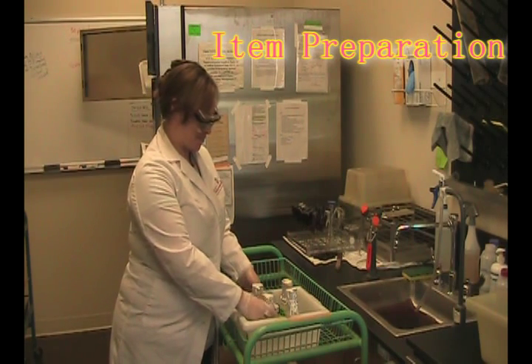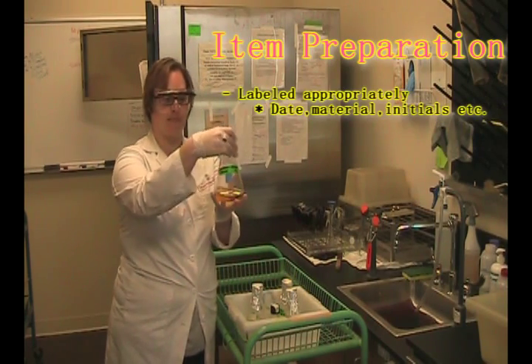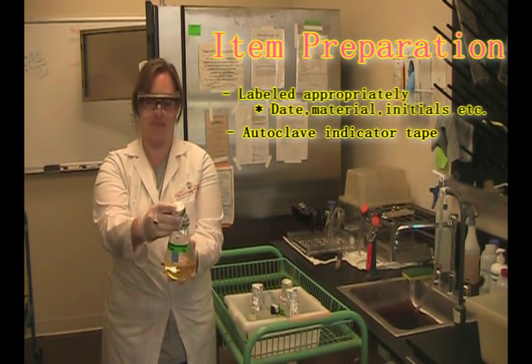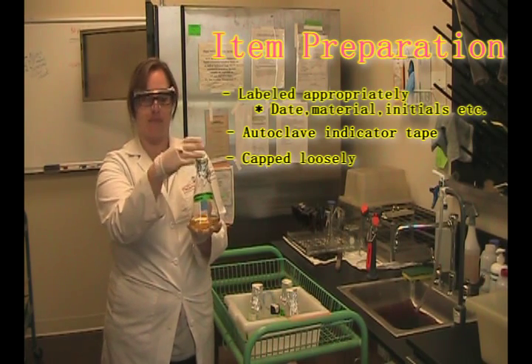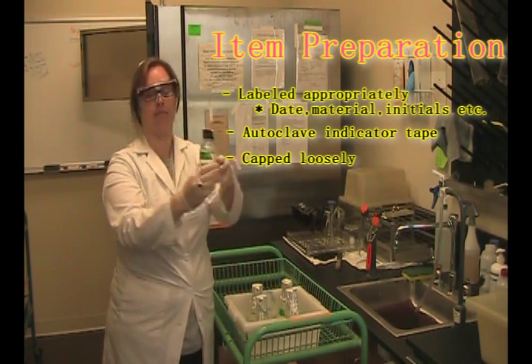While the autoclave is coming up, you need to make sure that all of the items you have to be autoclaved are labeled appropriately. They need to have a small piece of autoclave indicator tape on them so that you know when they're sterile. And they need to be capped loosely with aluminum foil or loosely covered with a cap that is not tightened all the way.